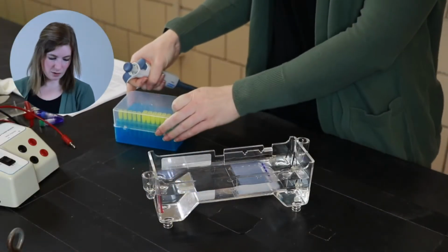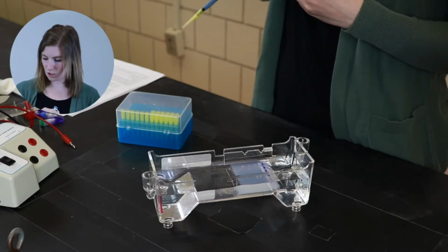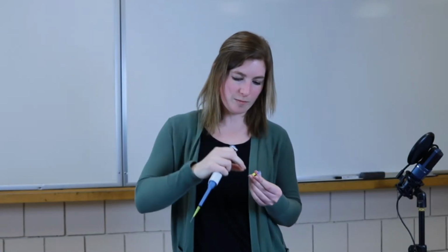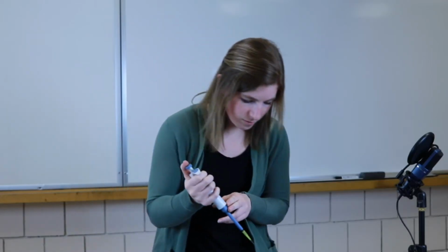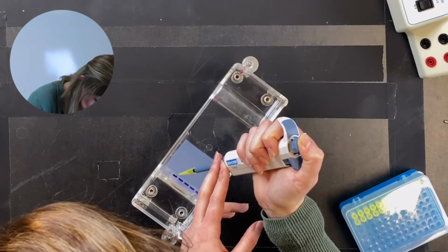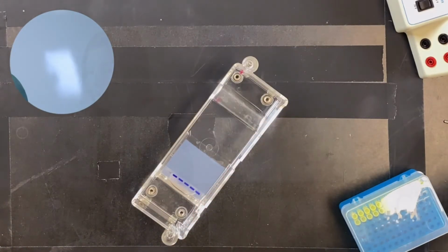I have 1 left, so I've got suspect 1 and 2 loaded. Now I'm going to have suspect 3, which is the yellow cap on my sample. All right, so now I have all of my samples loaded.